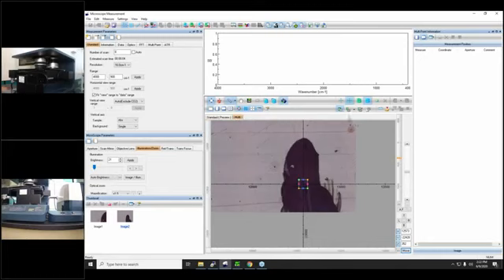Of course, we can have a 5x5, 7x7. We can even specify the area that we want to use, so we can search for different samples. Another feature that I really like is here. It's called the submap, and I can click on any of these locations, so I can have an even higher or wider area where I can do the measurement.